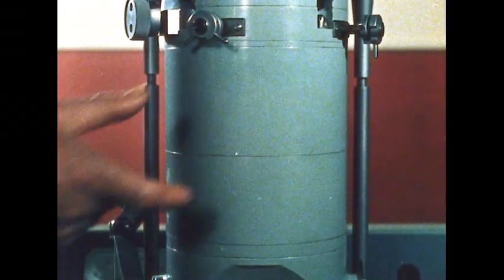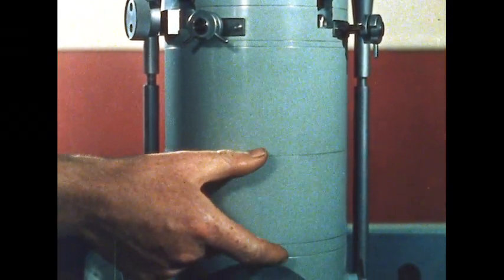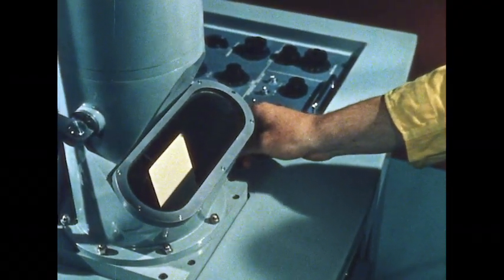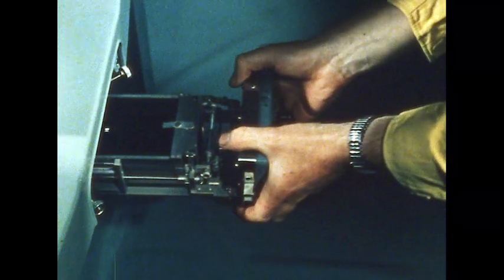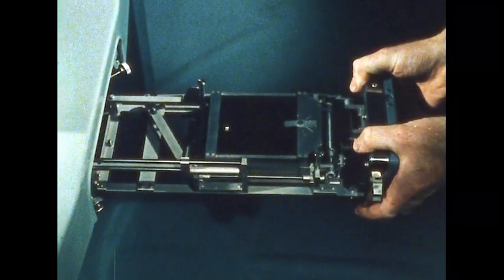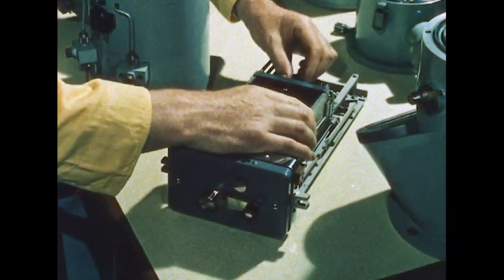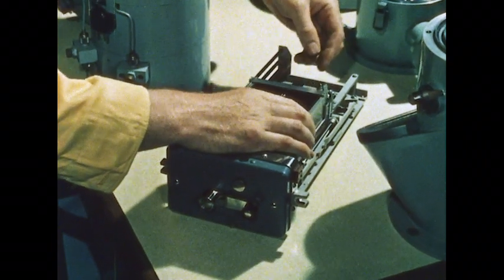There are two projector lenses at the bottom of the column. Below them is the viewing chamber. The image is projected onto the viewing screen, which can be raised to expose a photographic plate. The resolution of photographic emulsion is normally at least 6 times that of the human eye, so that an enlarged photograph reveals more detail than can be seen on the viewing screen.